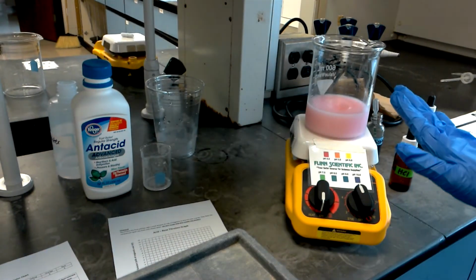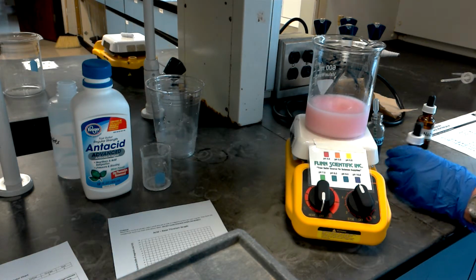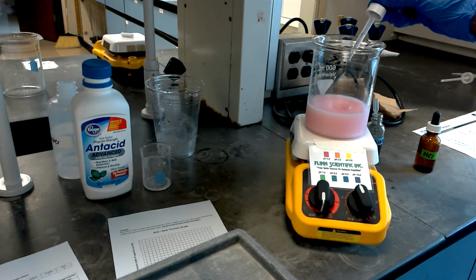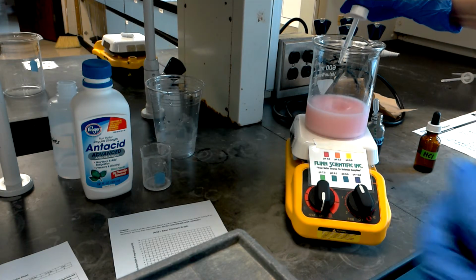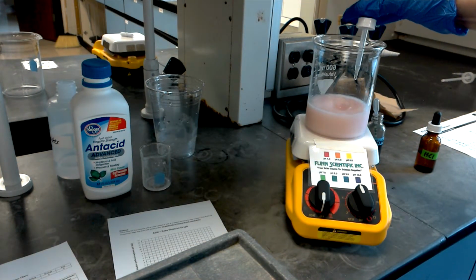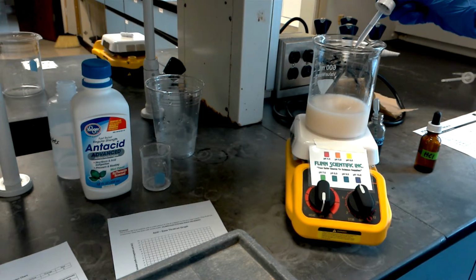But before we finish, I want to make sure that you are aware of the proper disposal methods. You don't want to put an acid down the drain like that. Acids are corrosive, as you know. So we want to neutralize this solution, and the way to get it back to a pH of 7 is by adding a base, because again, we're trying to raise the pH. So we'll add a few drops of sodium hydroxide so that we can get the color to a more green color and make it more safe to pour down the drain.